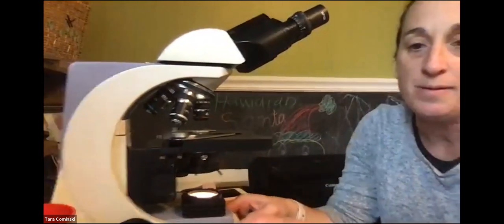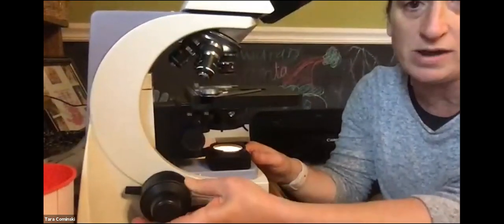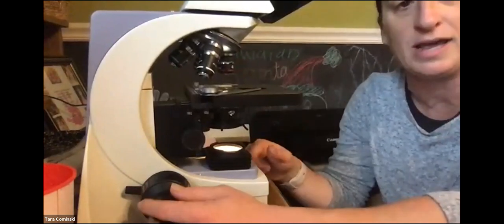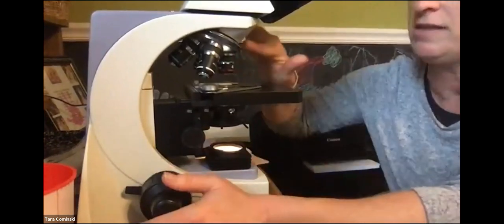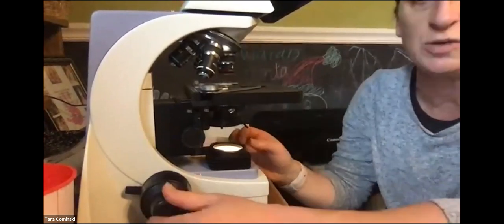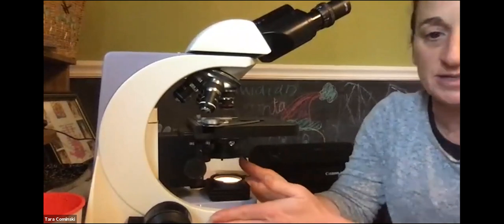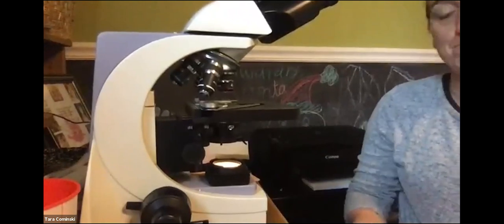Coarse adjustment knob is basically when we're focusing, okay? And that is right here. So coarse is the big one. You can see it moves this up and down a lot, whereas this is the fine adjustment. It takes a lot of turns to move it just a short distance. So when you're under scanning power, it's okay to use the coarse adjustment, right? When you're under low power, the 10x or the 40x, you want to use the fine control, okay? Light source, already said that. And then the base is this here, okay? So that's pretty much it in terms of the parts of the microscope.